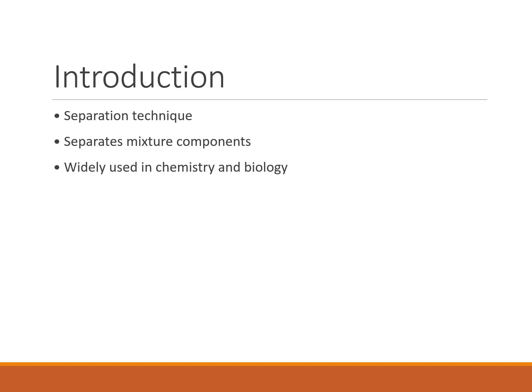So, chromatography plays a very important role in laboratories, industries, and research, and in chemistry, biology, and medical sciences also.